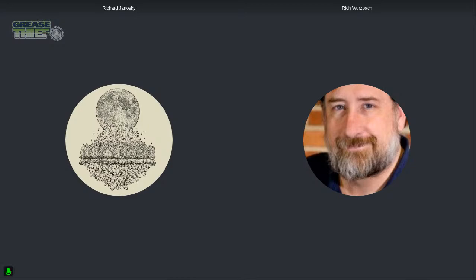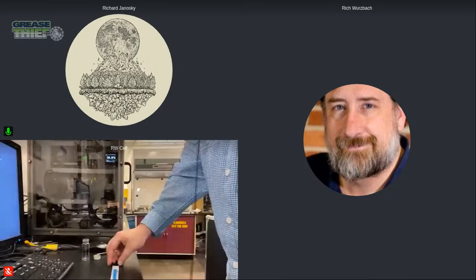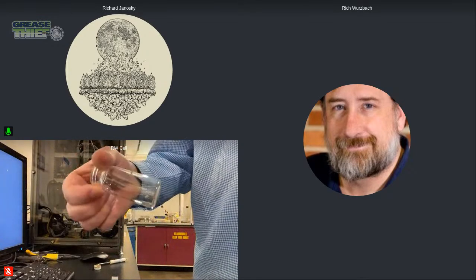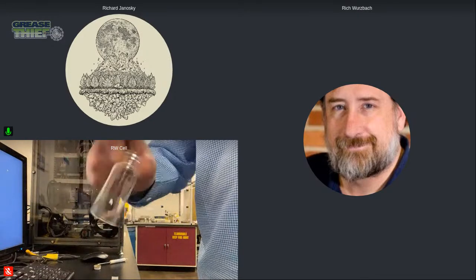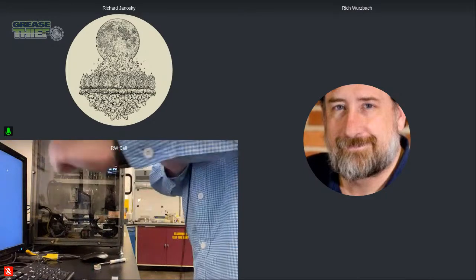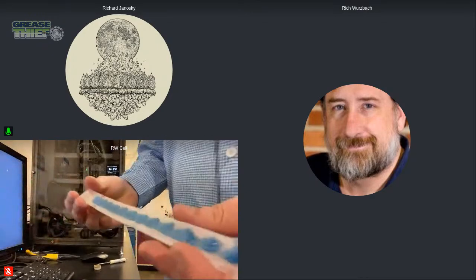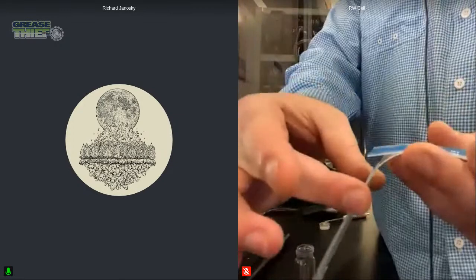Yes, I will go ahead. I'm going to turn that video back on, the camera. So I went ahead and got a vial, we run Vapor Pro for moisture. This is very similar to the vials that are used to dissolve samples for our RDE analysis. As we mentioned before, and I'll hold this up again in front of the camera, there are different sections that you can see. So I'm simply going to hold my hand on one section and just push up, and you can see where it just breaks off.